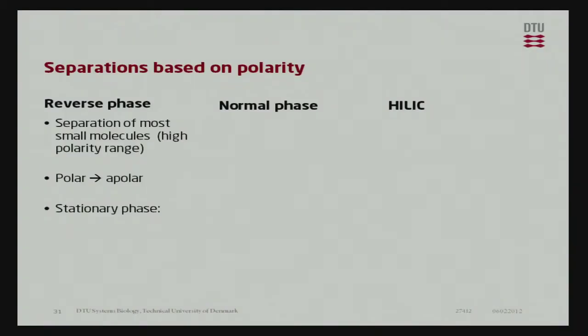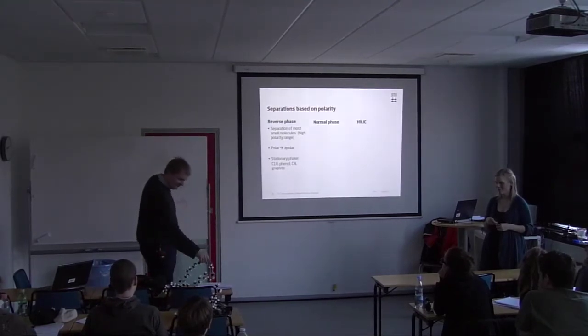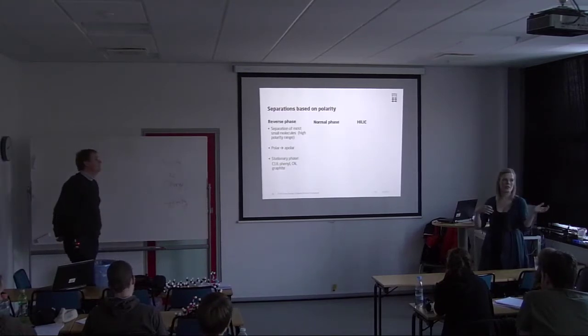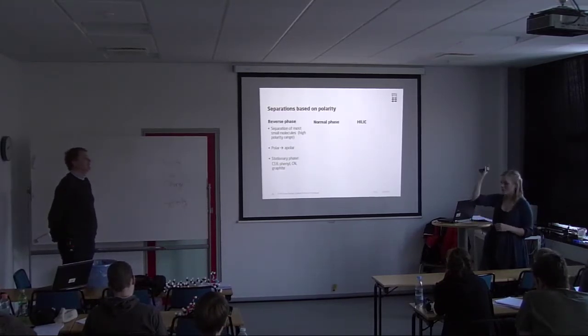The stationary phase is what's sticking on the beads or the particles. C18, as we talked about already, but you can also have other types of functional groups. If a molecule sticks too well, we could, of course, get a C8 or a C4. It's very easy for the chemist to make these. So that changes the polarity of the stationary phase, and that, of course, changes the selectivity towards the polarity of the compounds coming through.